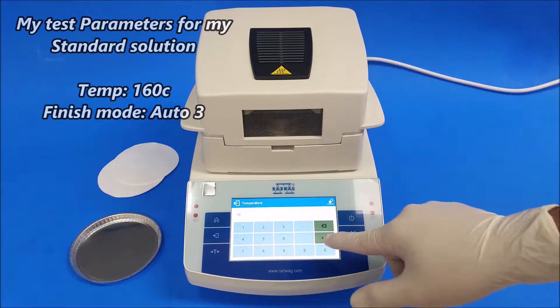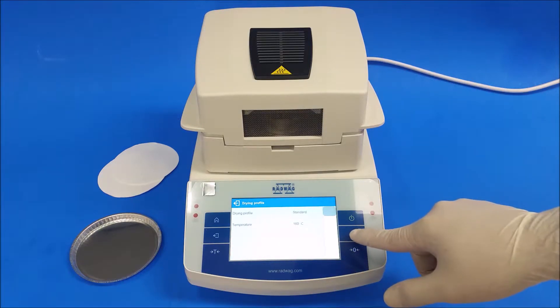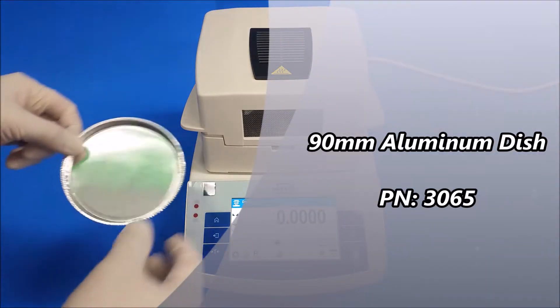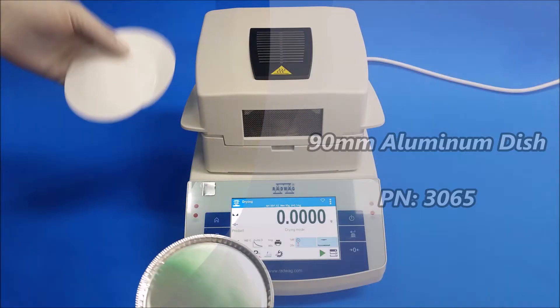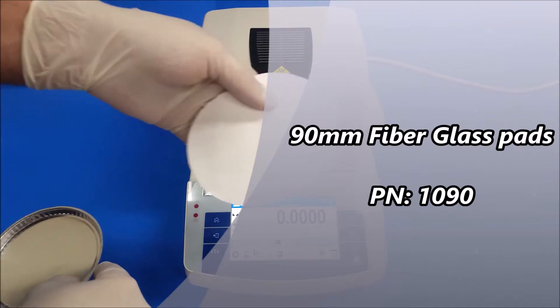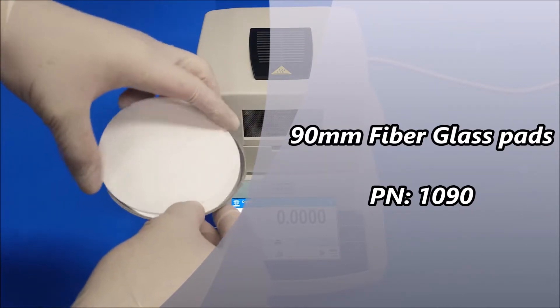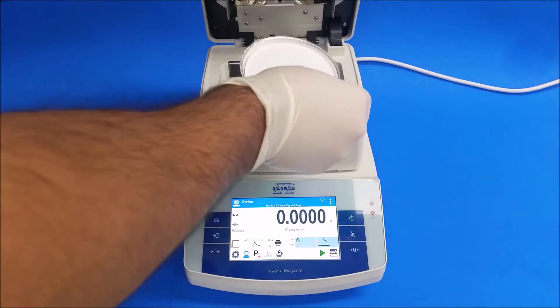The first thing we're going to do is have an aluminum dish ready with two fiberglass pads put together. I'm going to place this inside the unit.